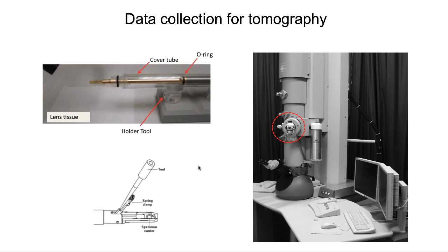But the difference in electron tomography is a very sophisticated motorized stage that can turn the EM grid very accurately to multiple angles. It should also have a stronger electron beam, because the higher the angle, the thicker the section becomes, and you need a stronger electron beam to generate an image of a section tilted to a higher angle.